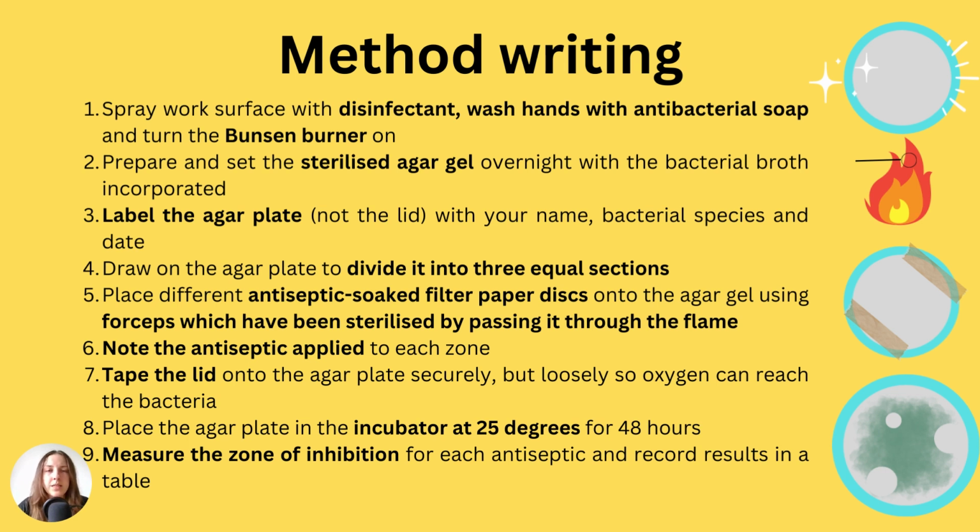You want to be using a flame that's a roaring flame, so that the area surrounding your equipment, the air has been cleared and destroyed of any bacteria that may be there, and that way nothing will fall into your agar gels. You also want to be wearing goggles during this point, by the way, because we're going to be using chemicals, we're going to be using bacteria, and you don't want to get anything in your eye, so goggles are a must.